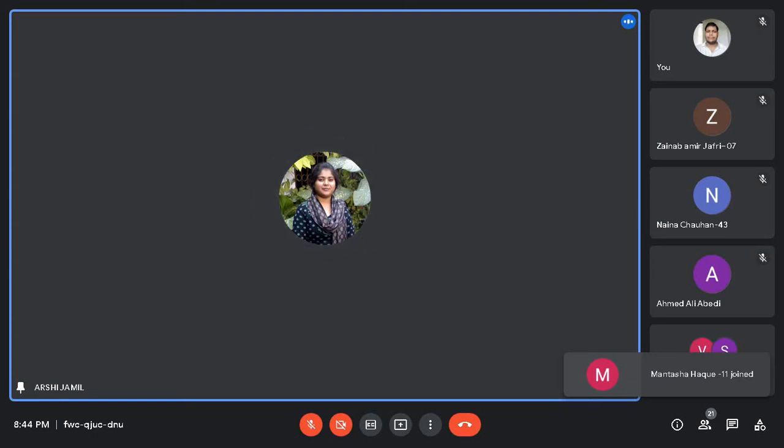ठीक है, आप नंबर चेक करते हो आपके उसमें एक पर्टिकुलर सैंपल में कितने कितने अलग अलग तरह के सीड्स पाए गए हैं. देन बेस्ड ऑन नंबर आप देखोगे कितने प्योर सीड्स हैं, कितने अदर सीड्स हैं, और कितने इनर्ट मटेरियल हैं. तो उसमें बेस्ड ऑन वेट आप उसका वेट करोगे.